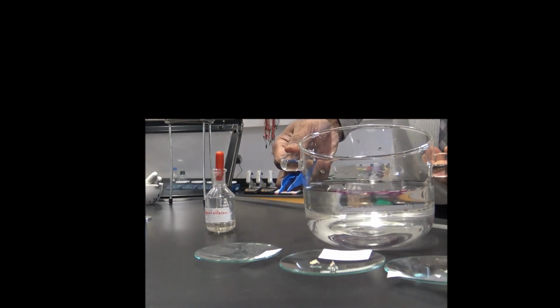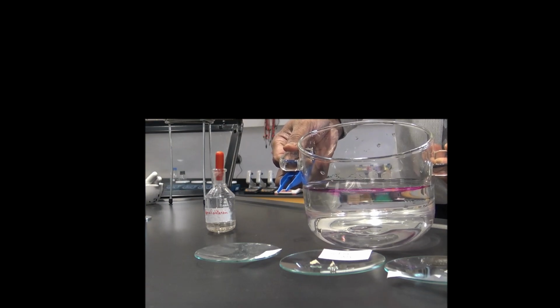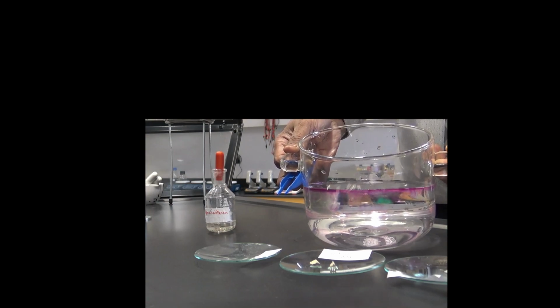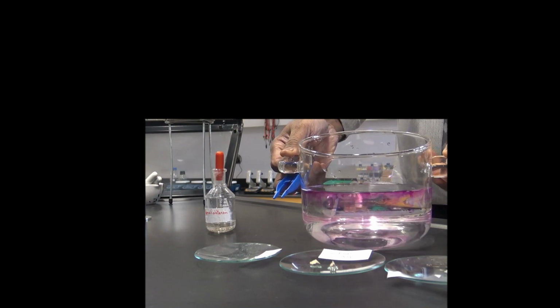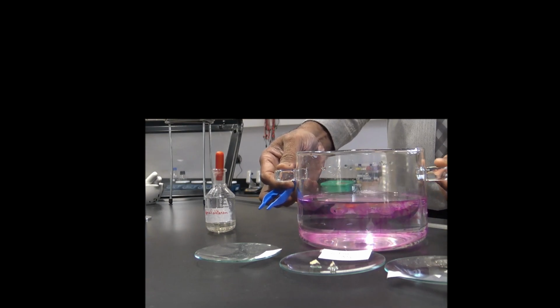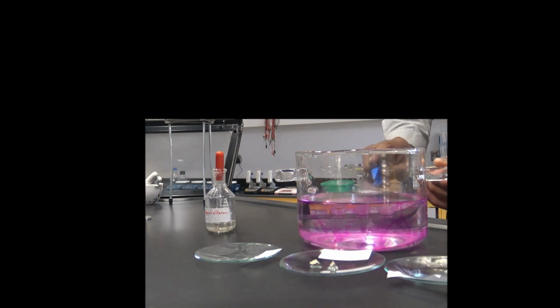As soon as we start, you can see bubbles generated, which is hydrogen gas. And you can see straight away the color is formed, which shows that lithium reacting with water forms an alkali, which should be lithium hydroxide. So the word equation should be: lithium plus water gives you lithium hydroxide and hydrogen gas. That you can write down as the answer in your exam.